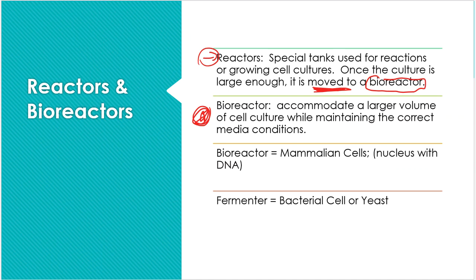And once we get so much, we're going to transfer the material out of a reactor. Not all of it, but some of it, right? Some of it's going to be transferred into a different reactor. But that reactor is a little special because that's where magic is happening. That's where things are getting made. So that bioreactor is going to have to be nestled and taken care of a little bit more, because sooner or later, that's where my active pharmaceutical ingredient is going to be. And that could be a number of different things. But that is basically the magic pot that we need to isolate and we need to take care of from that moment on.